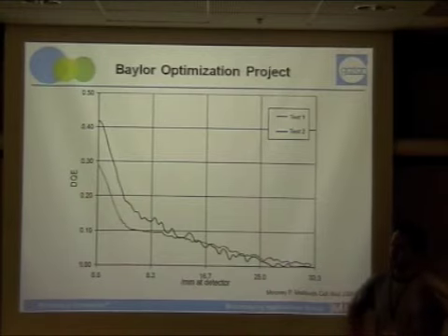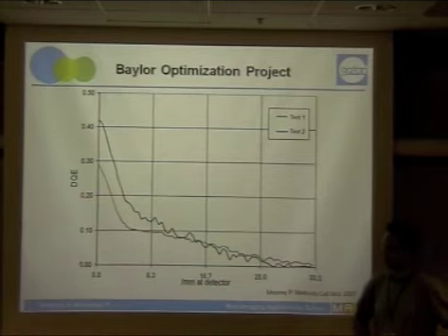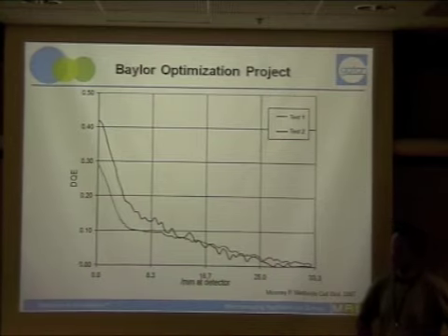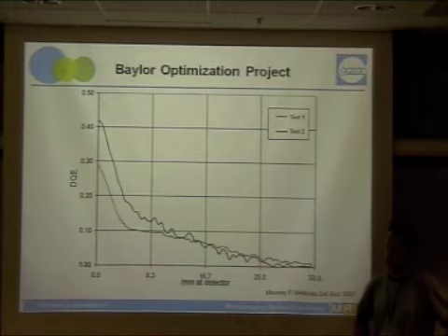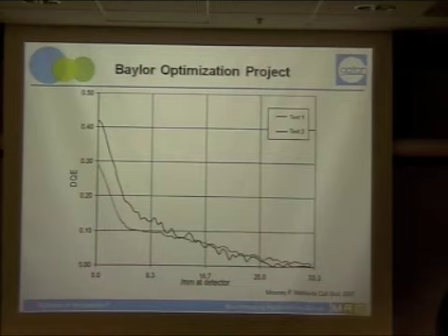That would be a very suspicious study. Are these the same viruses or different? No, different viruses. So it might be just chance. You also have, at low resolution, better contrast from CCD than film, which may help you for the alignment, or maybe you only consider relatively low resolution. It's hard to say what the level is. It's complicated. Okay, any other questions?